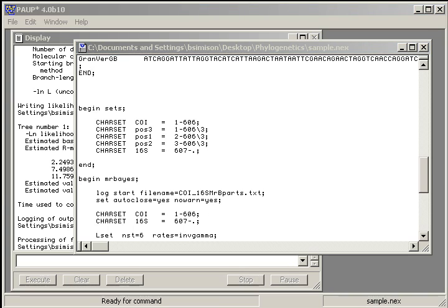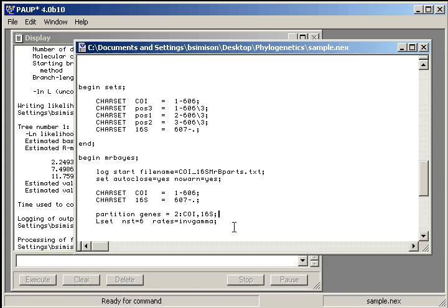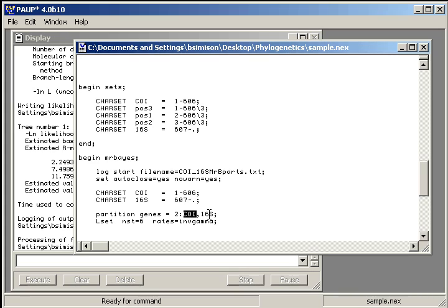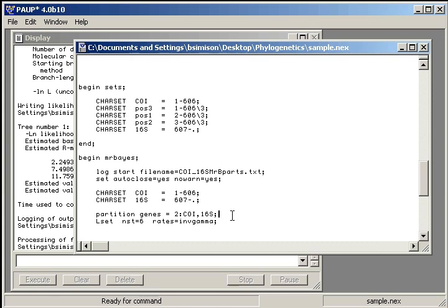So now we want to create partitions. In MrBayes, you do this by the partition command. Then you give it some name that you like. In this case, we'll use genes. Then it equals two. There's two partitions. And now you identify the two partitions that you've created up here with the char sets. And then you have to set the partition to the genes, or at least to the name you just gave it.